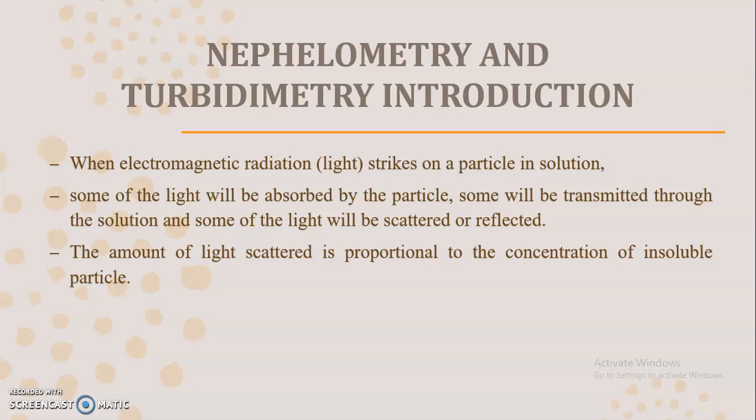The light scattering effect is known as the Tyndall effect because this is the name of the scientist who proposed this effect. Means when our solution consists of insoluble particles and light is passed through our sample solution, the light falling on these insoluble particles will be scattered, and this phenomenon is known as the Tyndall effect.